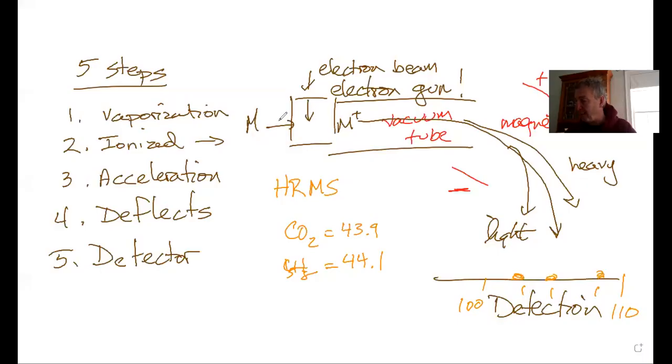However, you get a lot more from mass spec, because our electron gun can have a different consequence. If you ramp up the electron gun, you could take your molecule and smash it into bits, right? So we'll call it M1 and M2, 2 bits. Now, originally our M, which we'll call M1 and M2, were connected by 2 electrons in between them.